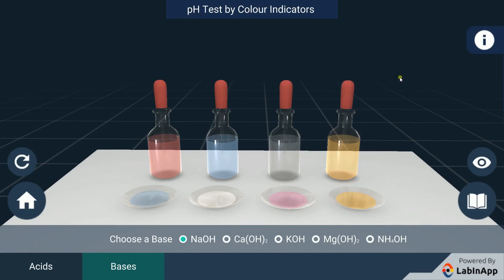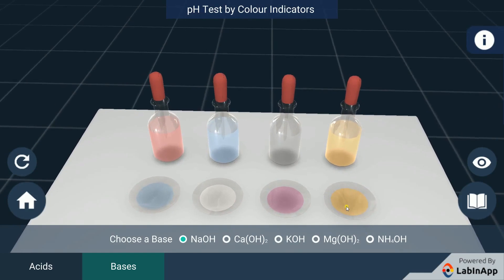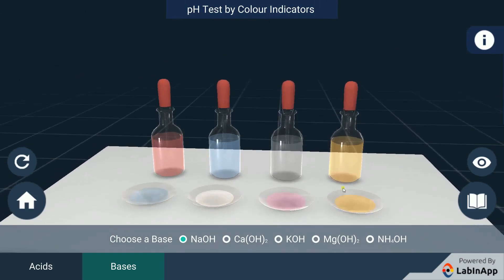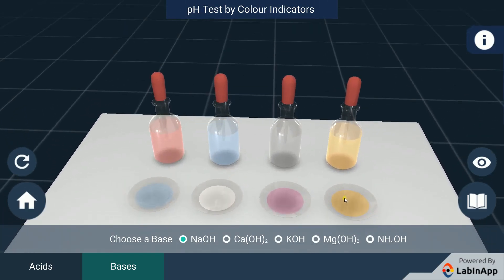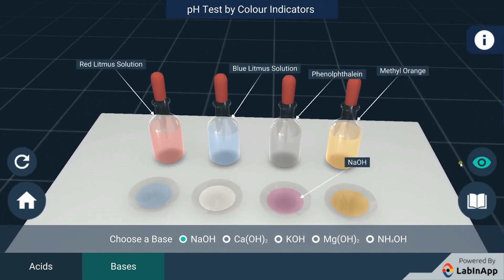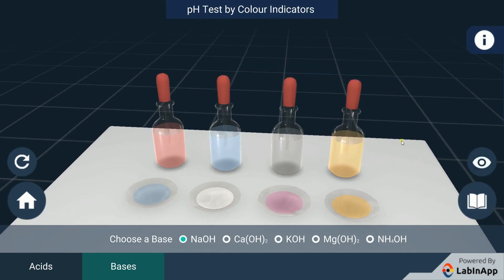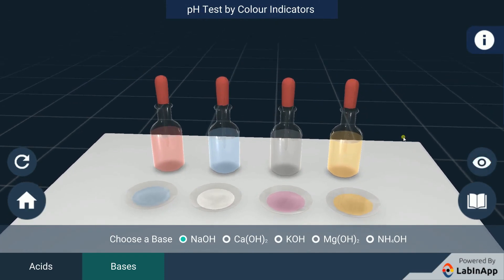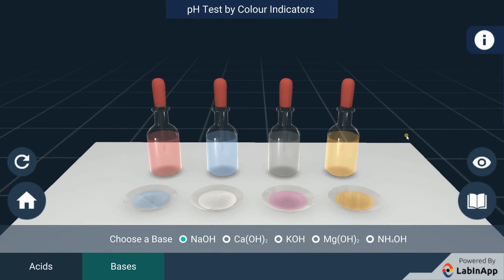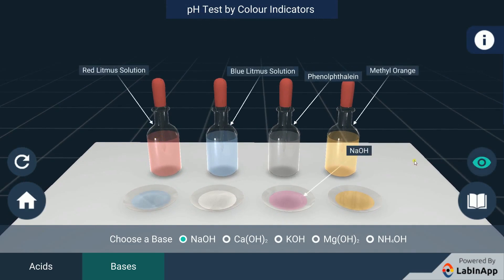The solution in the first, third and fourth watch glass changes its color to blue, pink and yellow upon adding red litmus solution, phenolphthalein and methyl orange respectively. We have observed that red litmus, phenolphthalein and methyl orange change the base solution's color, whereas blue litmus doesn't.